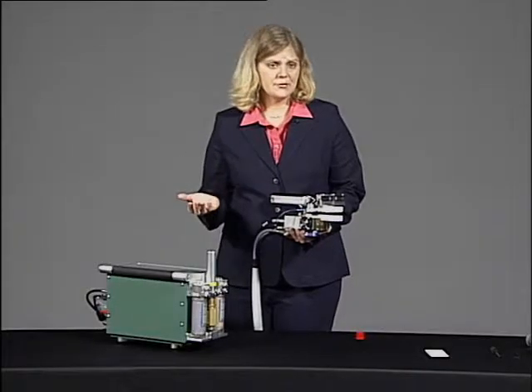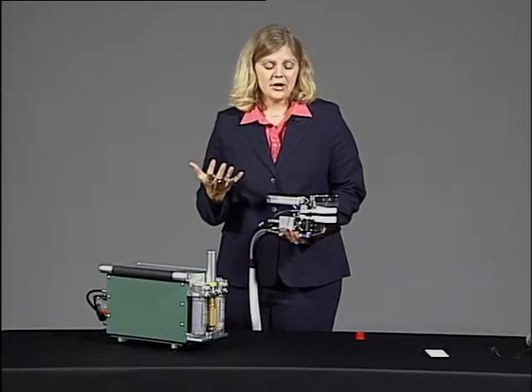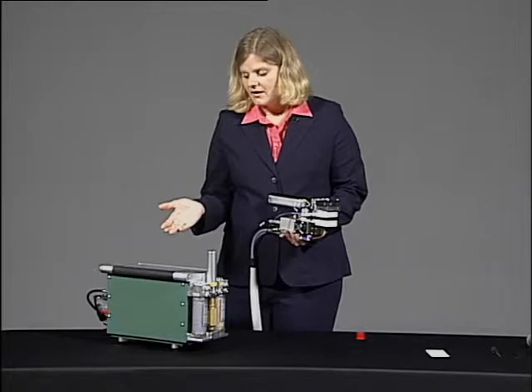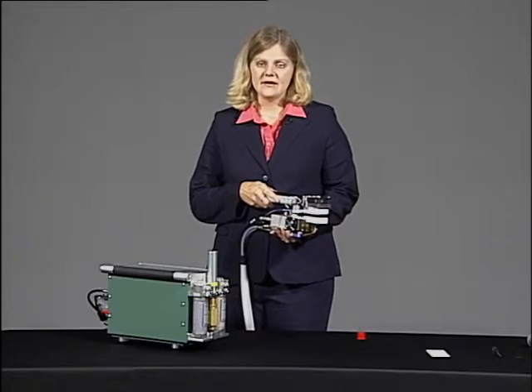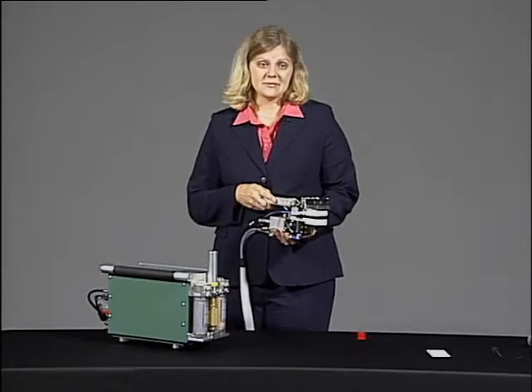Now, if you're in a room setting like I am, lights generally are very low in terms of PAR. I'm getting about 11, 12 in this room, and that's very typical for an office. If you are outside and you have a bright full sunlight, you should be expecting about 2,000 micromoles.